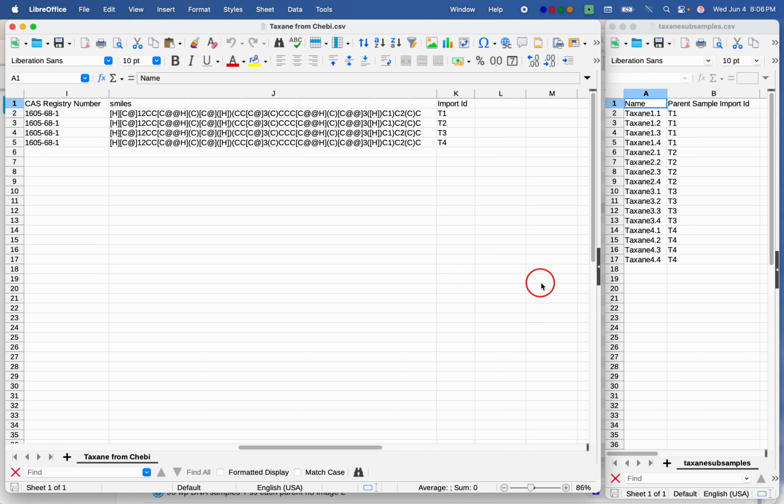they are imported. This is one of 2 methods you can use for associating samples with subsamples, or sometimes subsamples with containers. You can choose to either use arbitrary identifiers in a given import event to connect these things together, or alternatively, I could have specified here the unique identifier of existing samples already in RSpace, so that these subsamples would be added to an existing sample. In this case, I'll be making new samples and new subsamples at the same time.